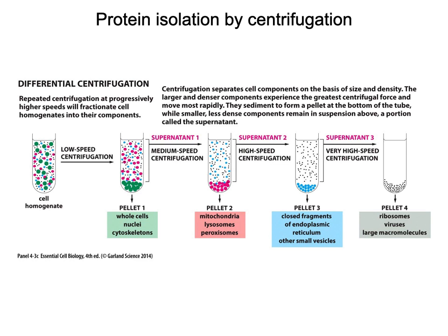I just briefly want to talk about the technique of centrifugation. So you can see that we have these different speeds. Low speed centrifugation would be something that you could do on a tabletop centrifuge. So maybe one of those little bench ones that you might have in a lab. You can put like 20 microcentrifuge tubes in, and you would spin that for like 5 minutes, right? And you would get your pellet formed.